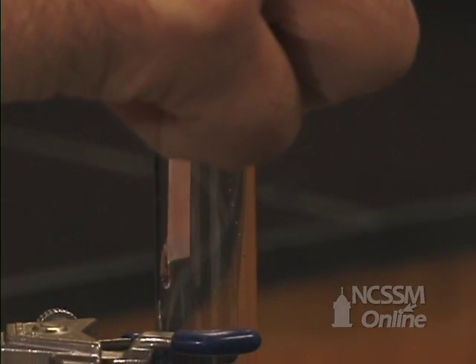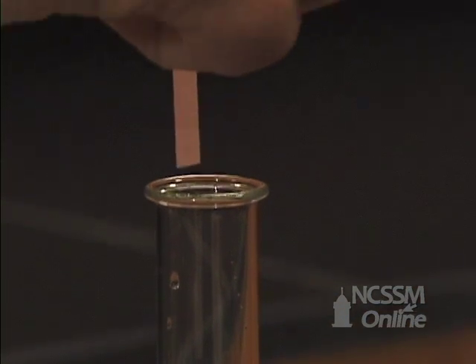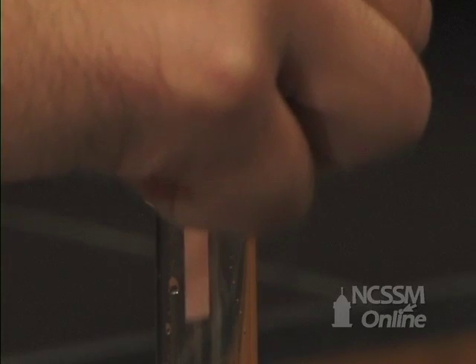The sulfur dioxide dissolves in the water to form sulfurous acid, which turns the blue litmus paper red.